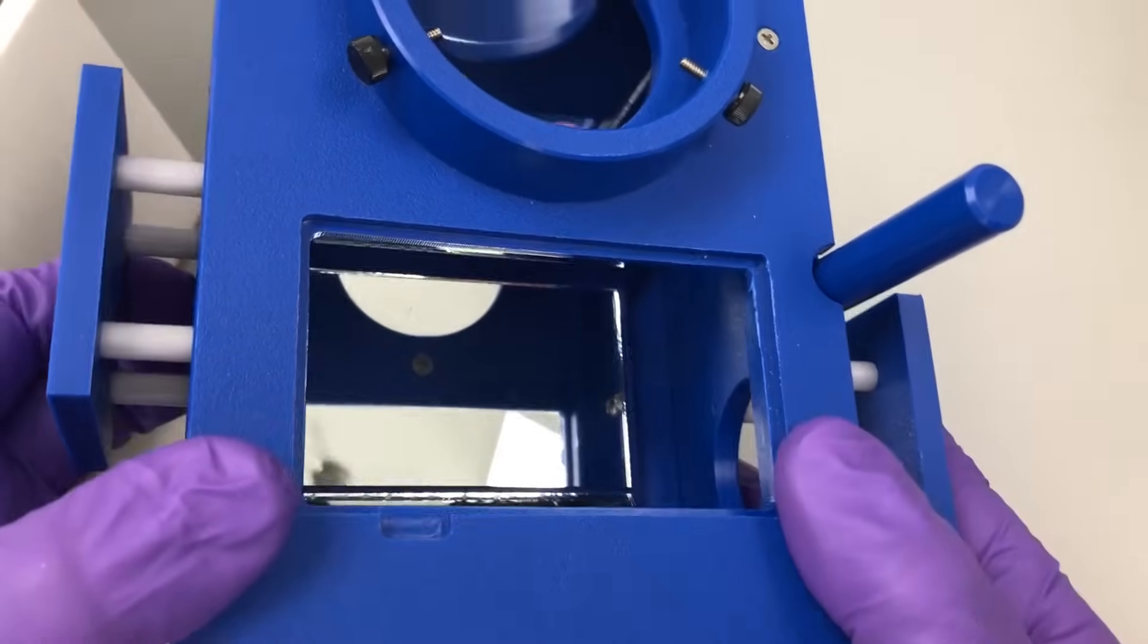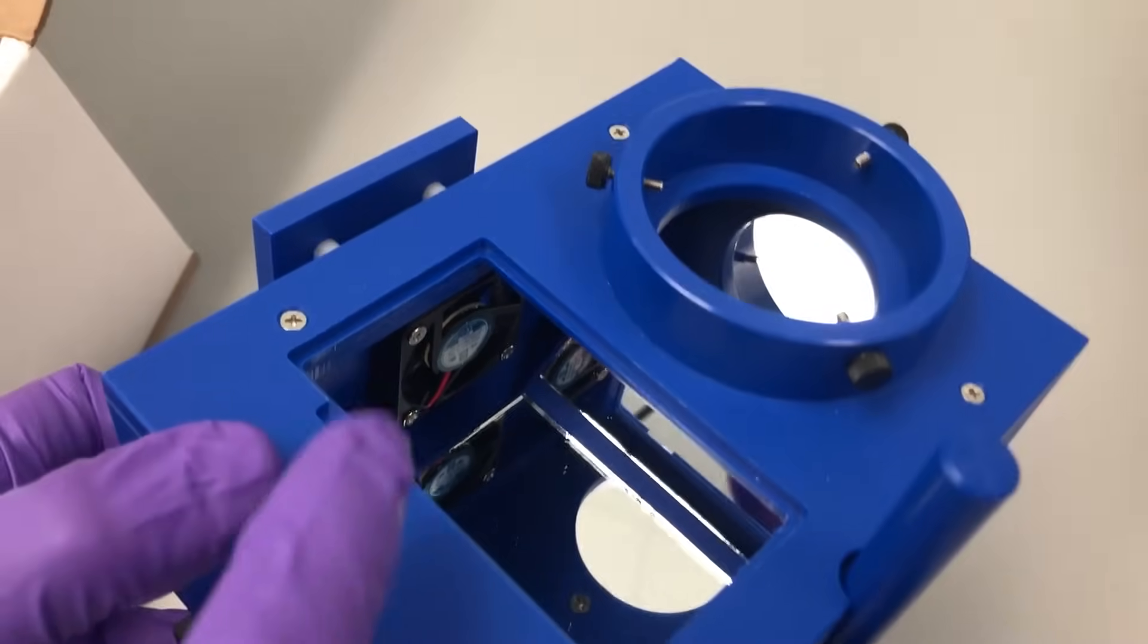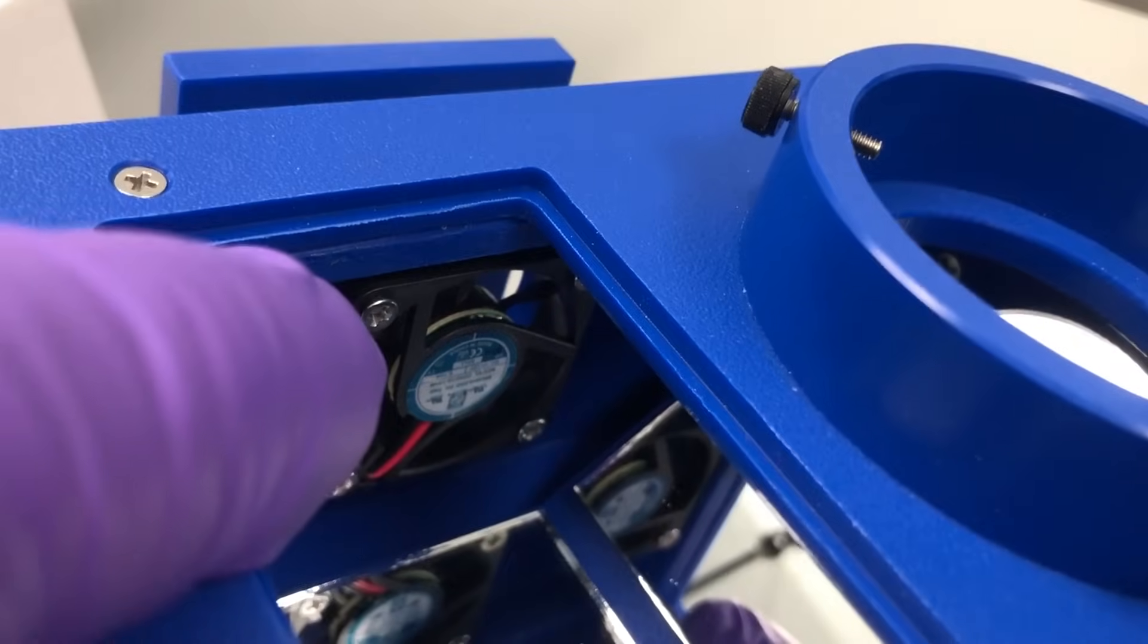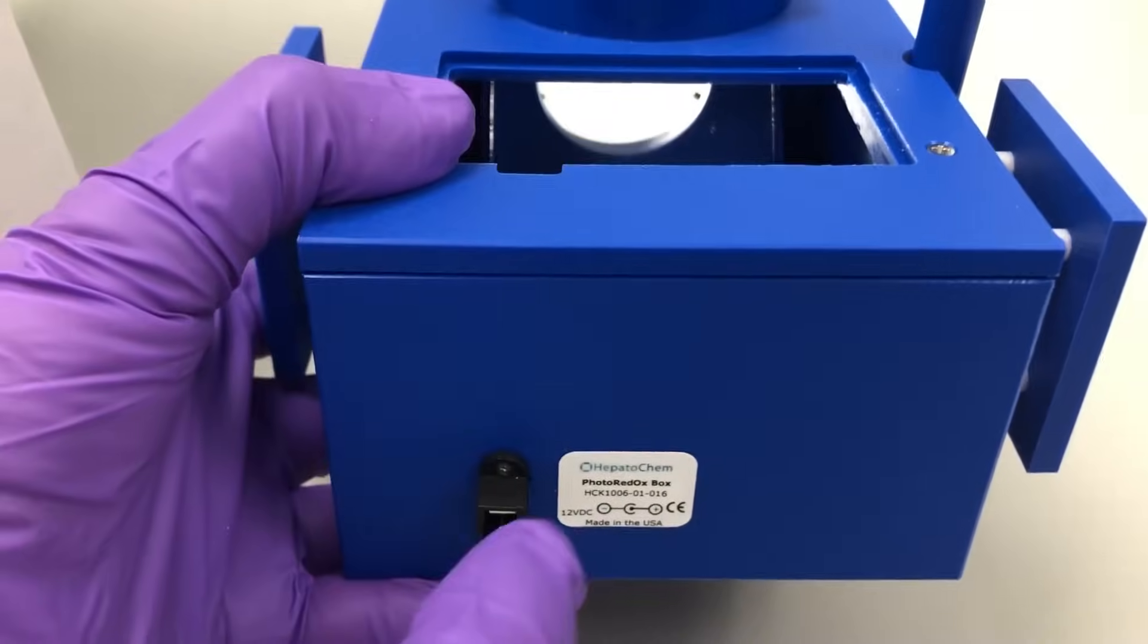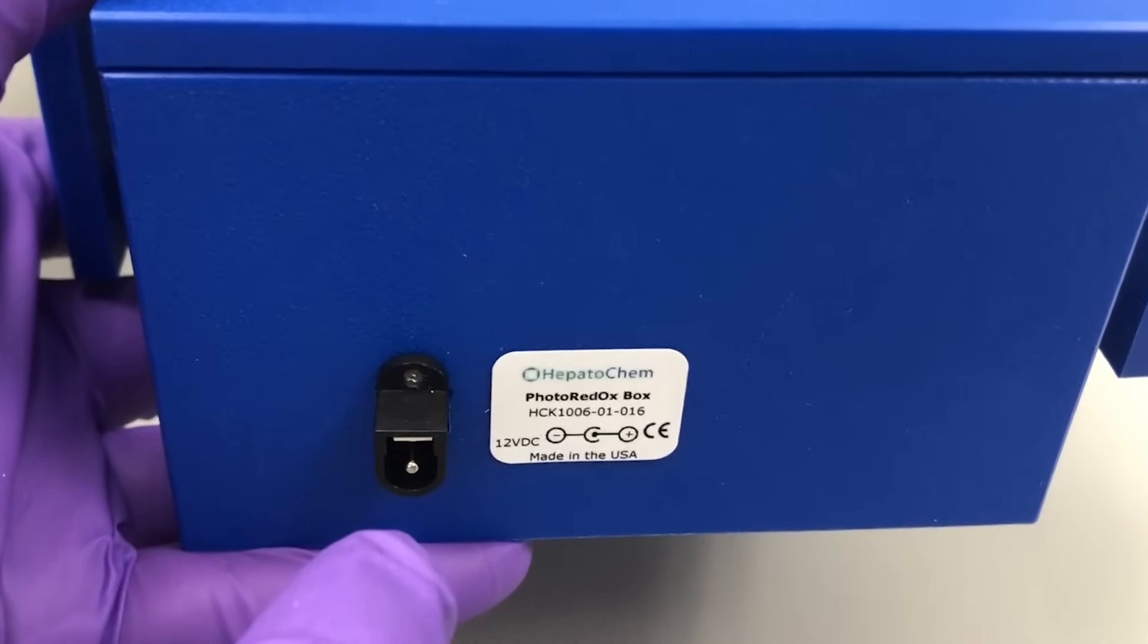The built-in fan is attached to the south wall of the reaction chamber to not interfere with the mirrors while maintaining room temperature for your experiments. It is operated using the DC adapter which is plugged into the reactor here.